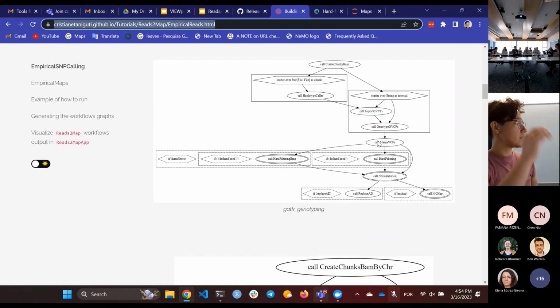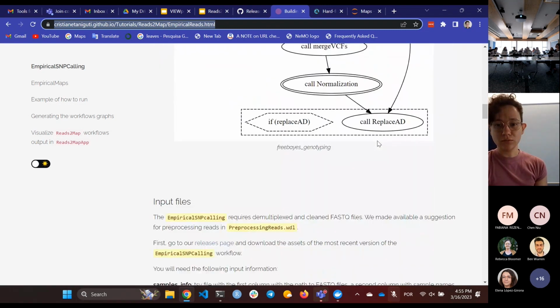And if you want to understand each one of the steps, or if you want to include other steps, it has a way to, it's like programming. You have many levels of how much you can learn. You can just run and get the VCF, but if you want to change something, you need to understand a little bit more what's happening behind. And I try to provide ways of doing that too.